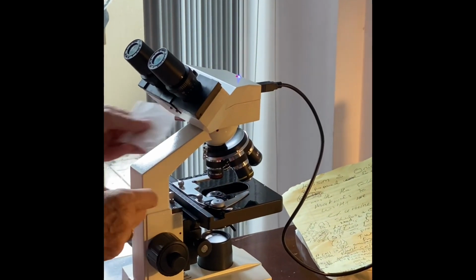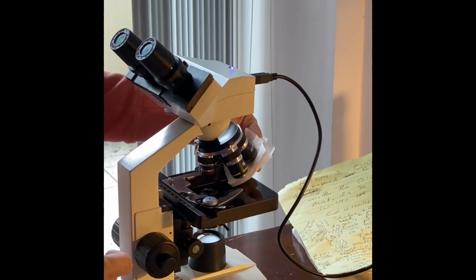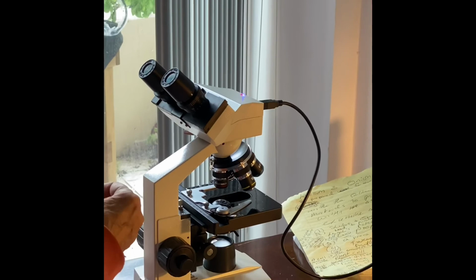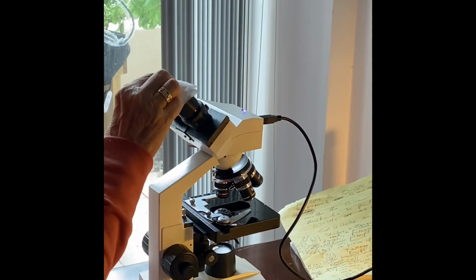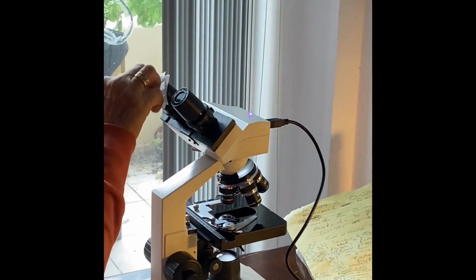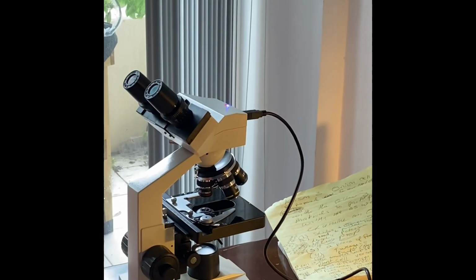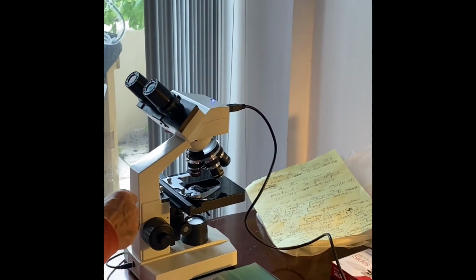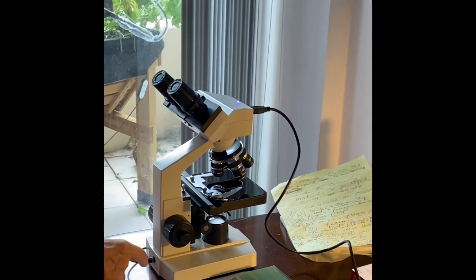So I just clean them all just to make sure that they didn't get any water or dye on them. And you got probably dust on the ocular lens. Clean that up as well. And now we're ready to put away the microscope.